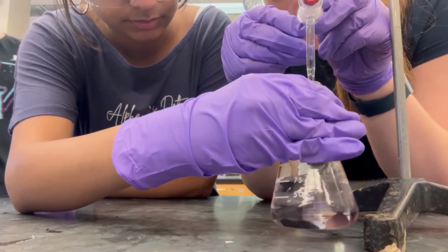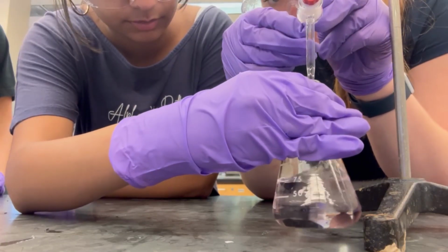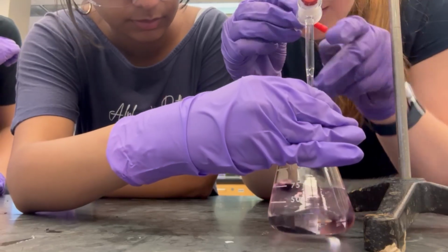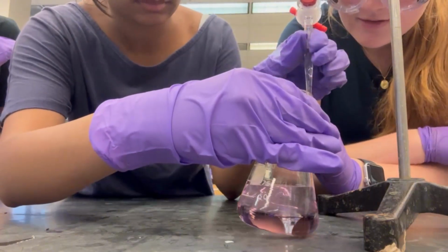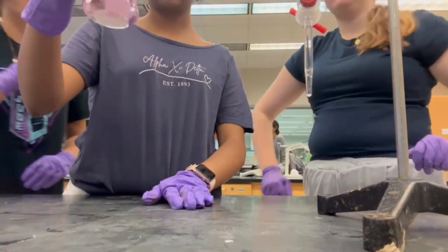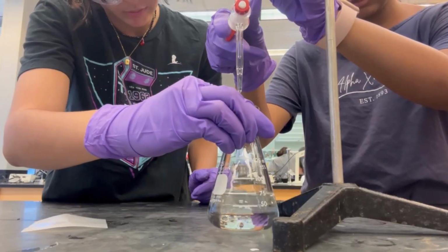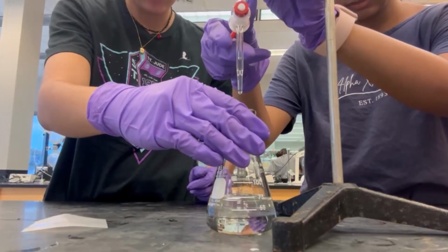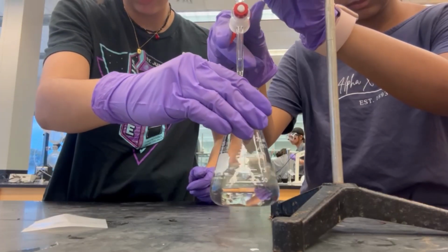To start the experiment, an indicator will be added to the analyte. You will then add the titrant NaOH to the analyte, making sure to swirl the analyte to mix the solutions, slowing when the analyte begins to display a pink color. The endpoint of the titration will be observable when the analyte remains a faint pink color for 30 seconds of swirling the flask.